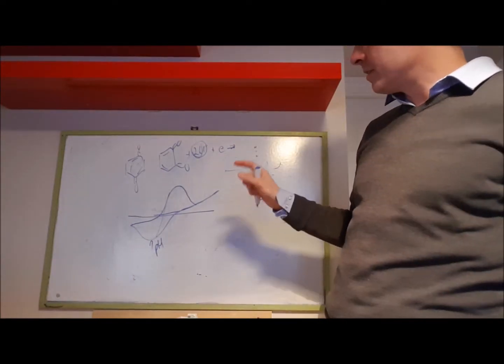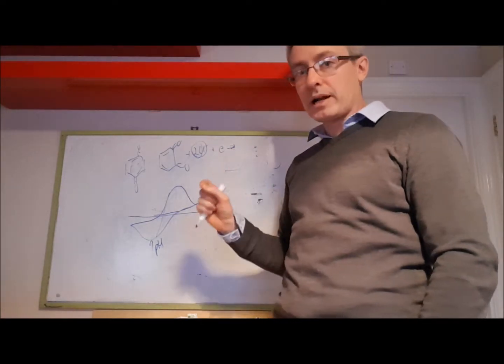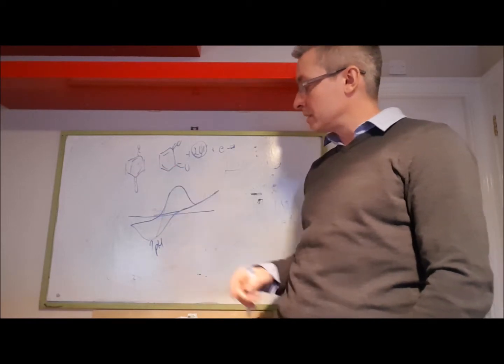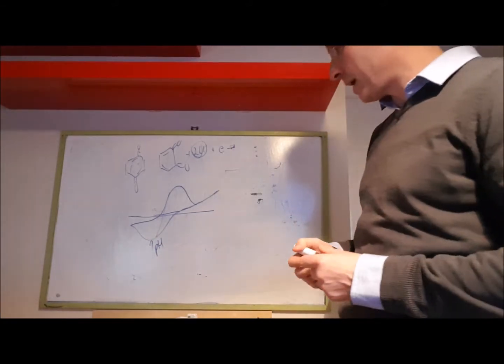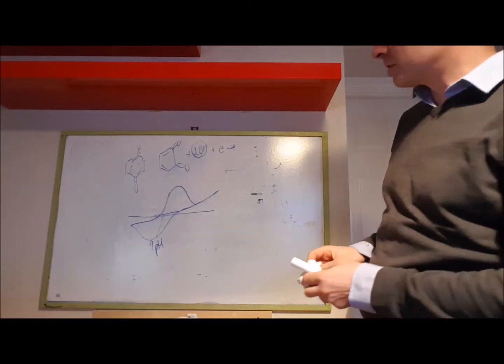So one idea, if I was going to measure pH, would be to use the carbon electrode itself, maybe deliberately oxidize it to make sure I had lots of these groups on it, and then watch the peak positions and see if that was a function of pH. You could actually modify carbon electrodes.